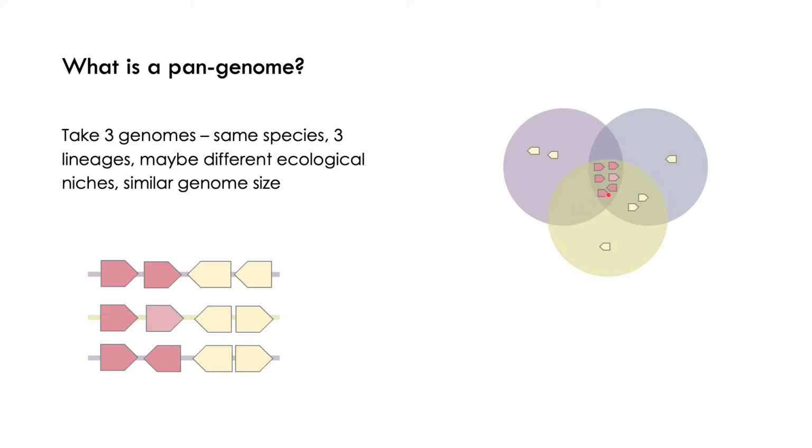But just to demonstrate that a little bit further, I'm going to colour the accessory genes here all as yellow. So we can see that in our 3 genomes and our 4 genes, half of the genome is core and half of the genome is accessory. And that accessory genome is a little bit different across each genome, but that's okay. And that's what we'd somewhat expect, depending, of course, on our data set, how diverse the data set is that we're comparing.